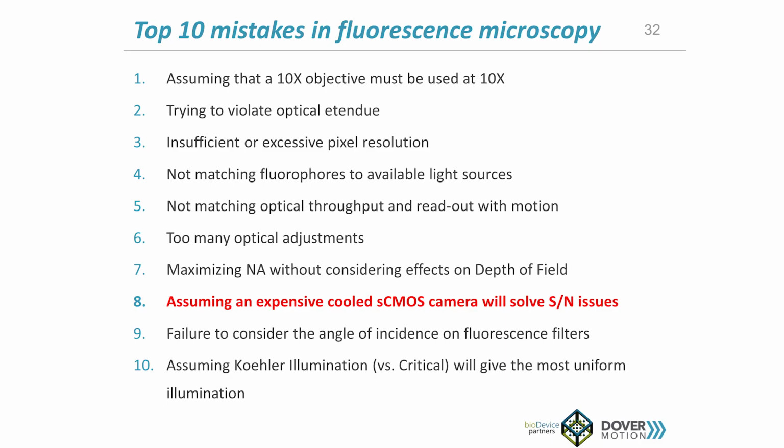Another one that I commonly run into is that the client at the first meeting will say, we don't care, let's just get a really expensive scientific CMOS camera in the system, and that will solve our signal to noise problems, when in fact that very rarely solves the signal to noise problems. If your integration time is less than 3 seconds, it's unlikely that a scientific CMOS camera will solve anything, and you can use some of the very good Sony cameras that have been coming out lately. Yeah, in particular, dramatic savings are possible if you investigate Sony's newest generation of backside illuminated CMOS sensors. They're getting remarkably close to scientific CMOS and can be less than 1/10 the price.